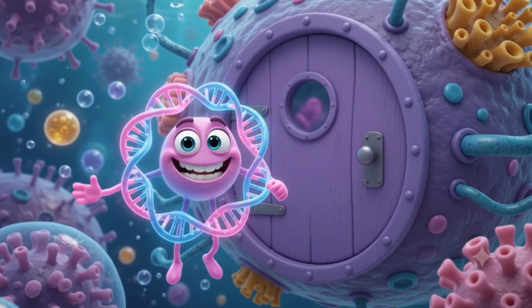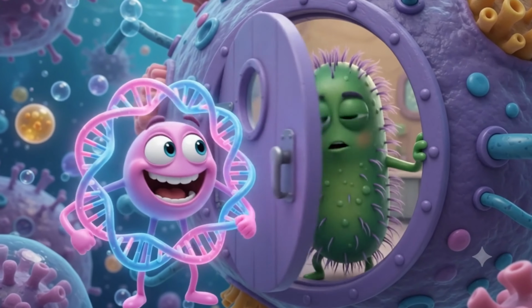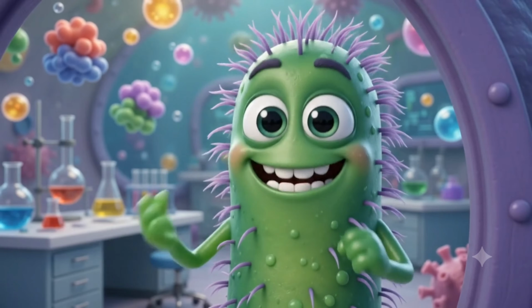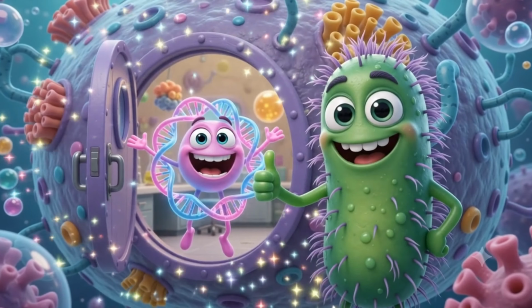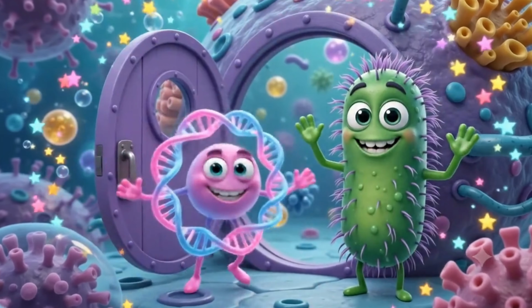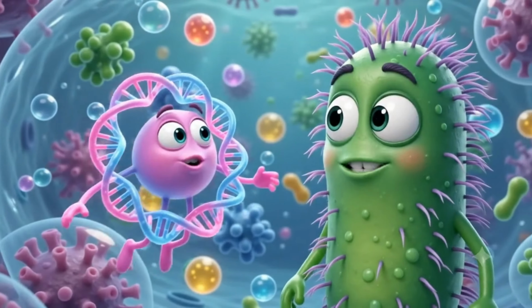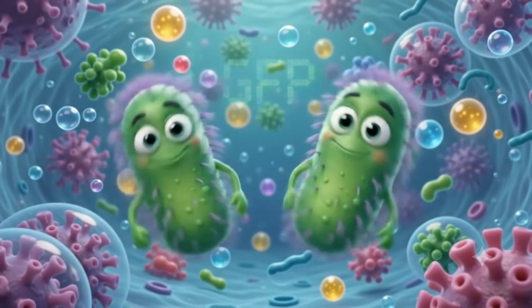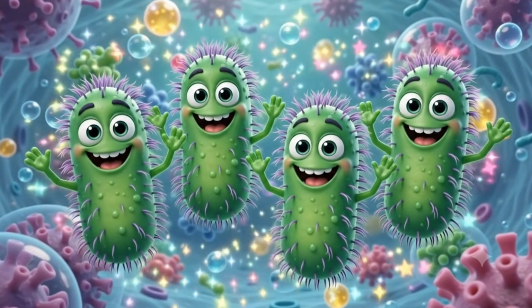Can scientists really teach bacteria new tricks? Absolutely! Let's discover the amazing process called bacterial transformation. Bacterial transformation is the process of introducing foreign DNA into bacteria, allowing them to copy and express new genes.